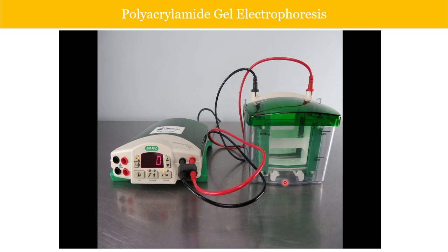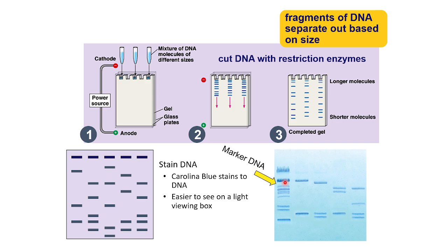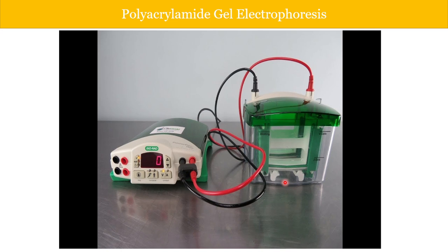You give it different names, like I was telling: molecular weight indicator, reference indicator, ladder, or something like that. So it's the same, it is just used as a reference. Okay, great. So that is all about your agarose gel electrophoresis. The other type of electrophoresis, which probably you people have done, is the polyacrylamide gel electrophoresis.